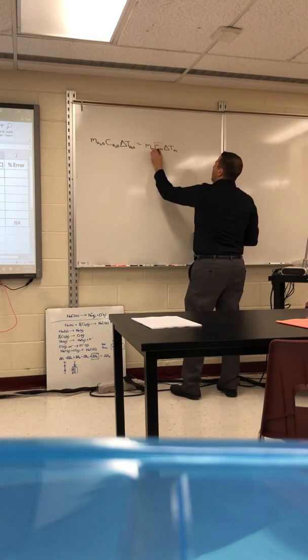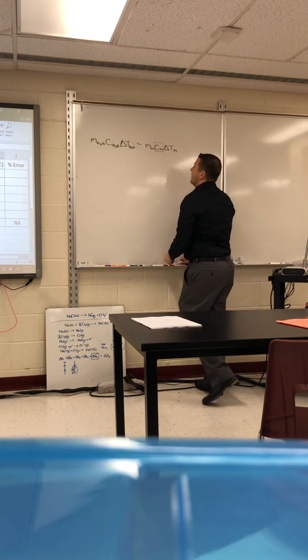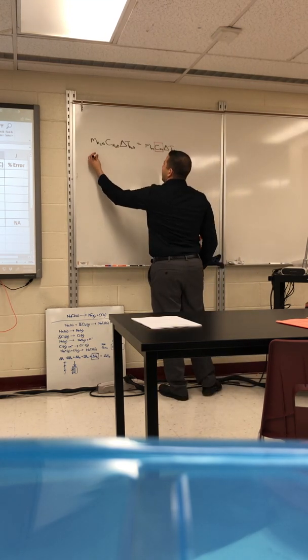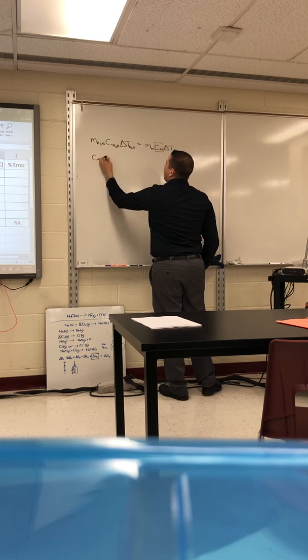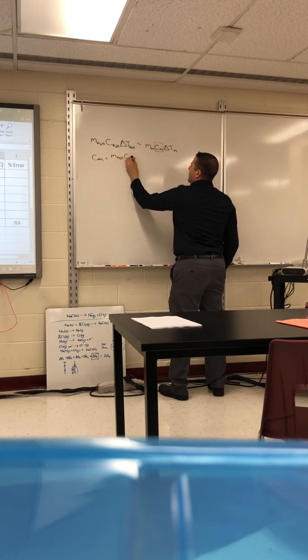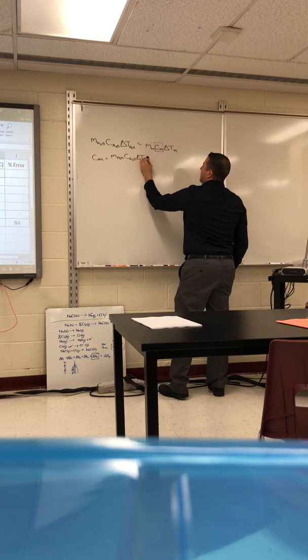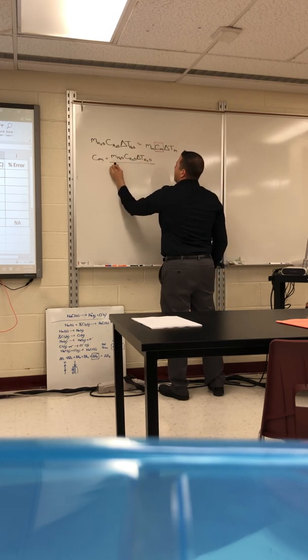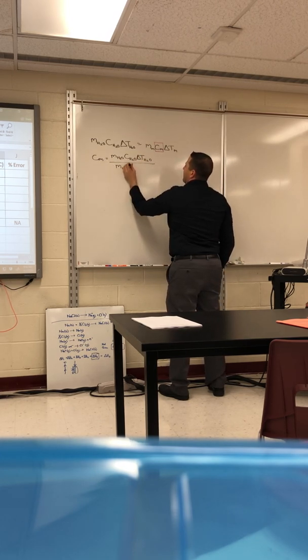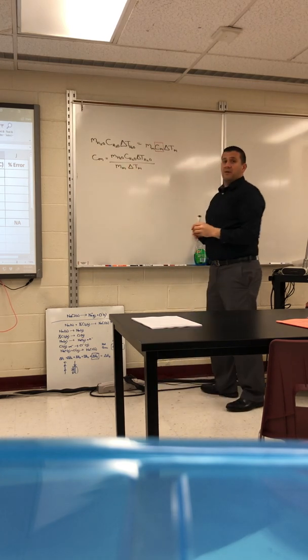So basically, I need my equation to find c of metal, which is going to equal the mass of water times the c of water times my ΔT of water, over mass of the metal times ΔT of the metal. Okay, everyone agree with that?